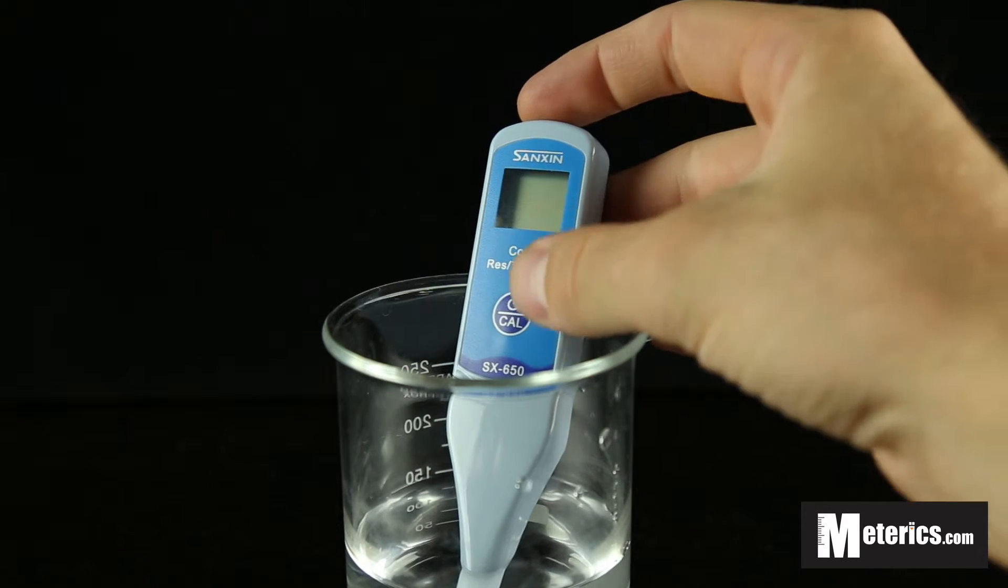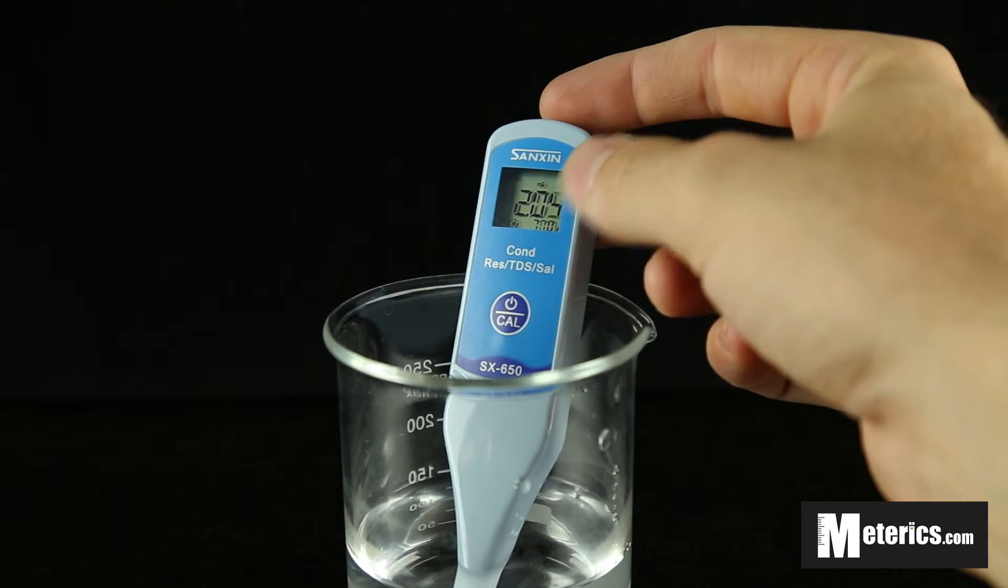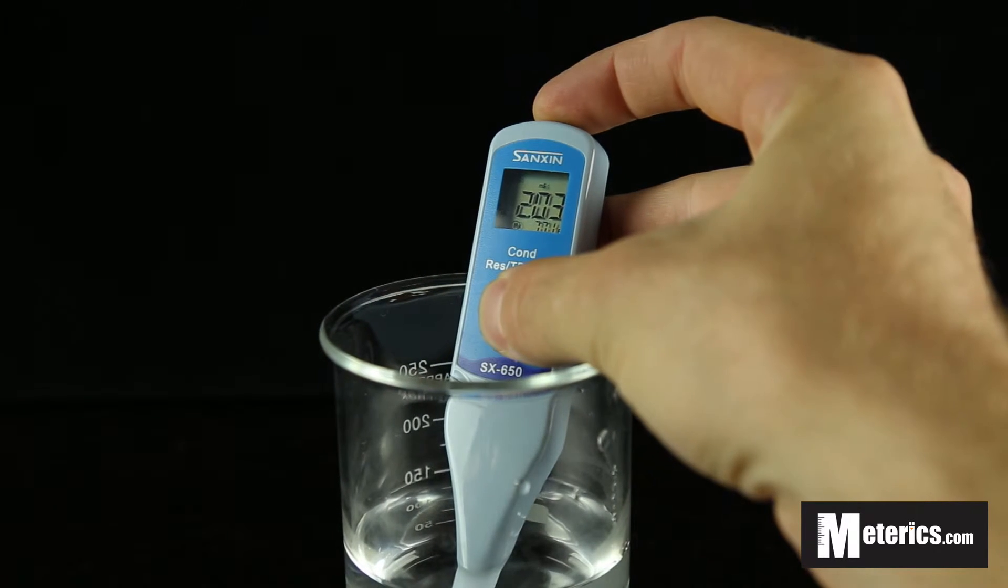To get started, you simply turn it on with the only button on the meter, and then to switch between measurements you hold that button down for a moment.